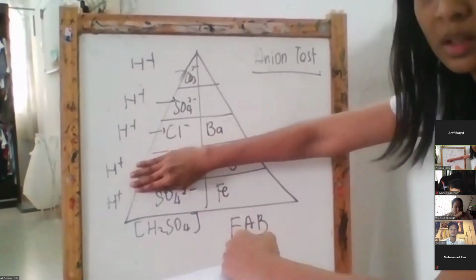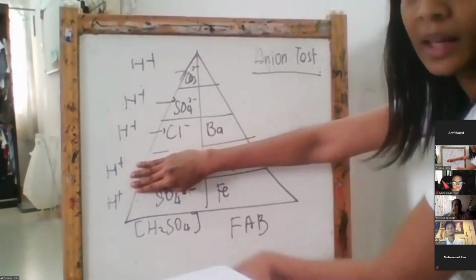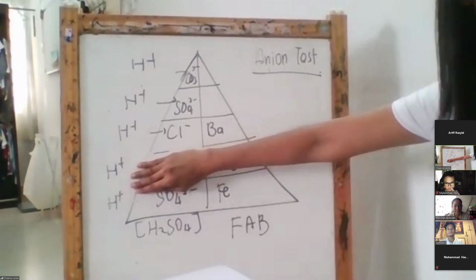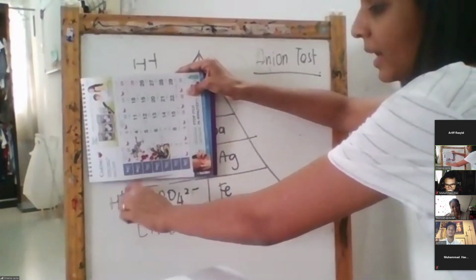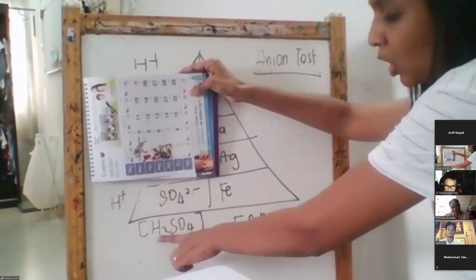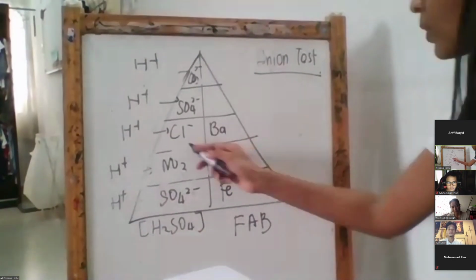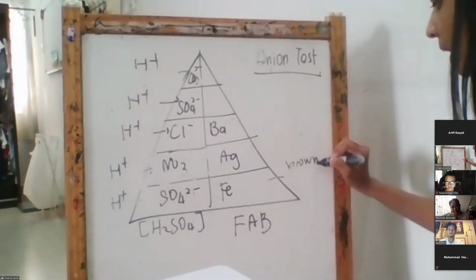Can you all see what teacher is saying here? Yes. Okay, and then only for nitrate is very special. I add on a concentrated sulfuric acid. I repeat what I'm saying. If I want to test for nitrate, I first add my H plus, telling me it's an acid. So I add sulfuric acid plus iron(II) sulfate and a concentrated sulfuric acid. And what will I get? What is my product when I test for nitrate? A brown ring. Very good.